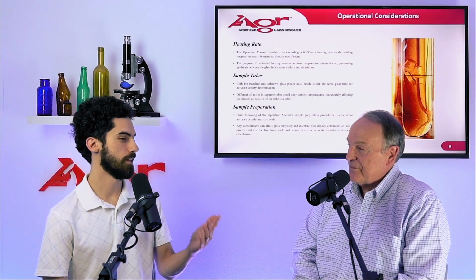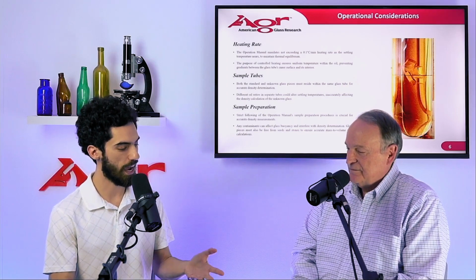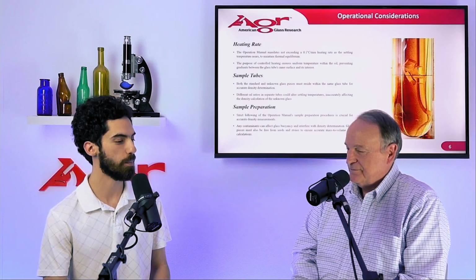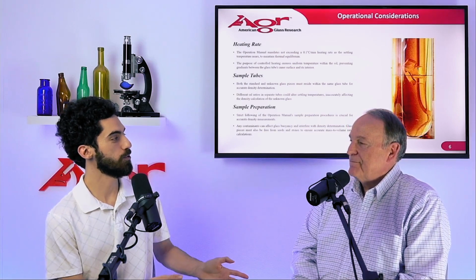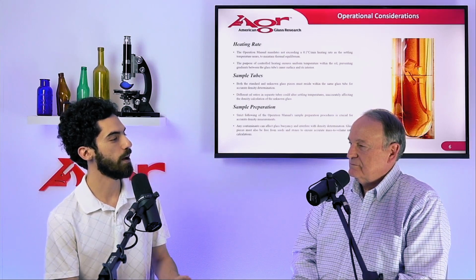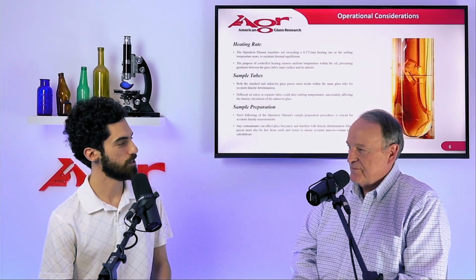I see. Yeah, and it's still better to measure via the polarizing lenses because you can actually get a value of how much stress is caused by the cord, and whether it's problematic. Yep. But you can still use this detection method alongside, if you have the extra sample tubes to cover pieces. Well, that's interesting to know about.